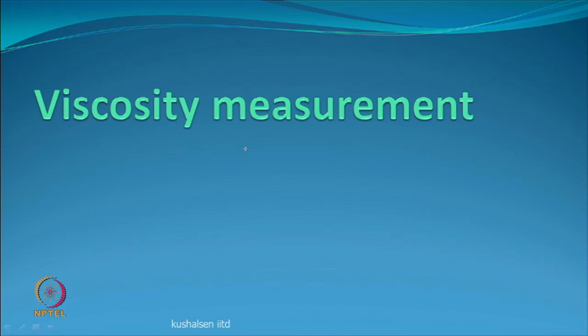It is like when you say crystallinity of a polymer, you say how did you measure? Say I use wide angle X-ray diffractometer, very good. Other one can say I used a DSC to measure the crystallinity. Or density to measure crystallinity. You have to say, well, this is density crystallinity, this is X-ray crystallinity, and this is the other method that we use. So, you have to talk about the method. And similarly, viscosity measurements, despite all the fundamentals looking very nice, because there is going to be relative motion, how do you do this motion, how do you observe this behavior is what is going to actually also matter. You say that well, I use this method to do this at this temperature, and of course, hopefully pressure is going to be atmospheric pressure.